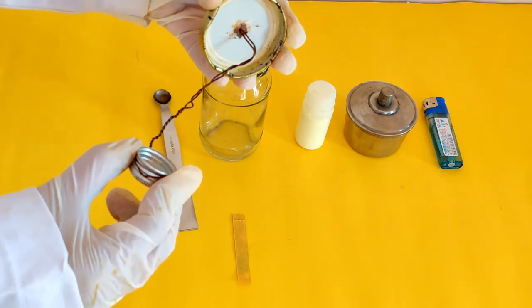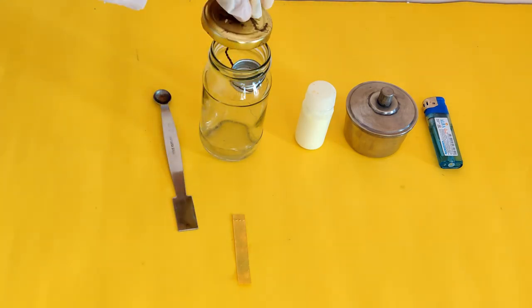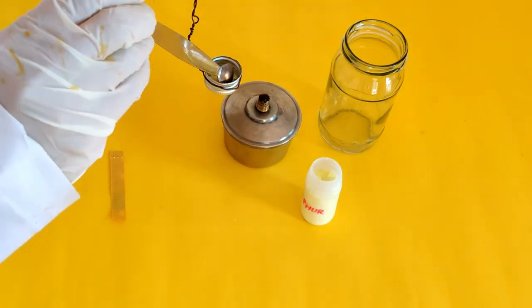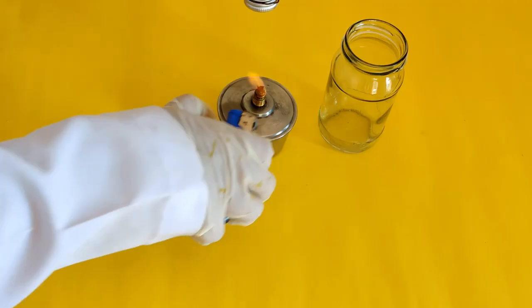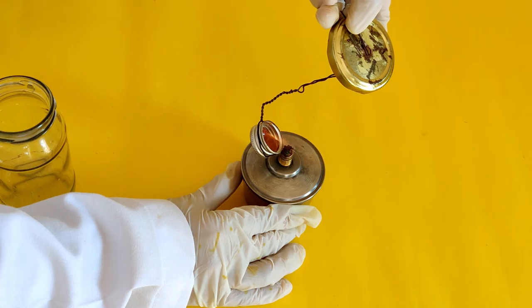Insert one end of the wire into the hole in the lid of the glass jar, so that you can lower the cap into the jar and close the lid. Now, add a spatula full of sulfur to the cap. Light the spirit lamp and hold the cap above it while exposing the sulfur to the flame.